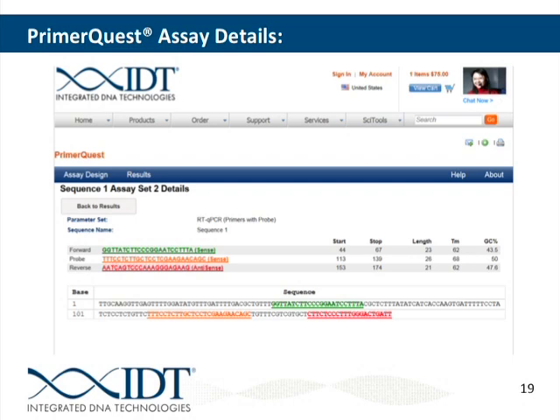So for this, we would select somewhat similar sequences. And then I like to go down to the algorithm parameters and switch our word size to 7. So hopefully in just a few seconds, all of our hits will appear.